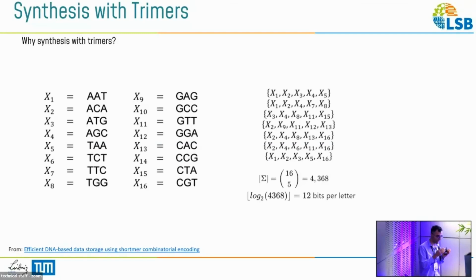So they are working on it, so that when analyzing, they treat the trimers as monomers. If there is some insertion or deletion at the trimer, they ignore it, because there shouldn't be any deletion or insertion there. If there is any, it is not from the synthesis. It is added at the PCR for the library preparation, and also in the sequencing part.